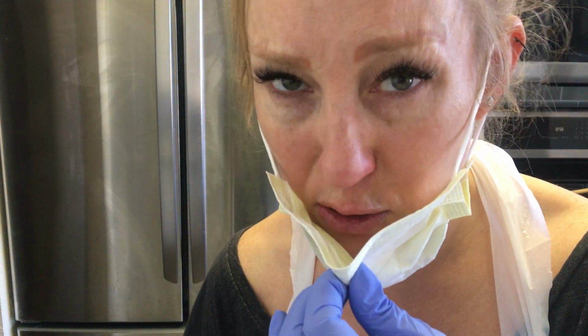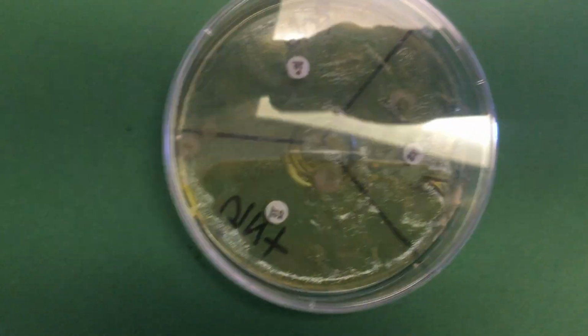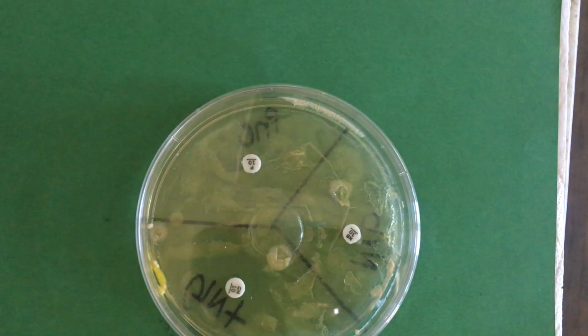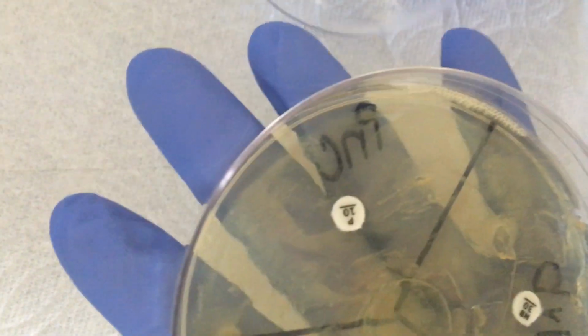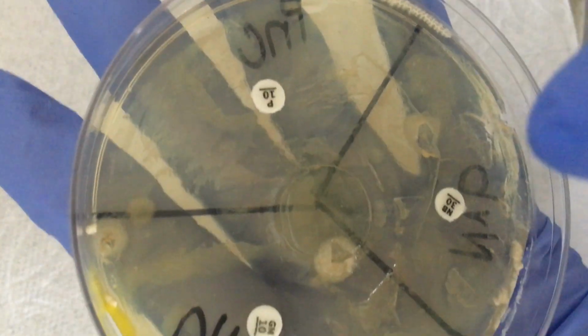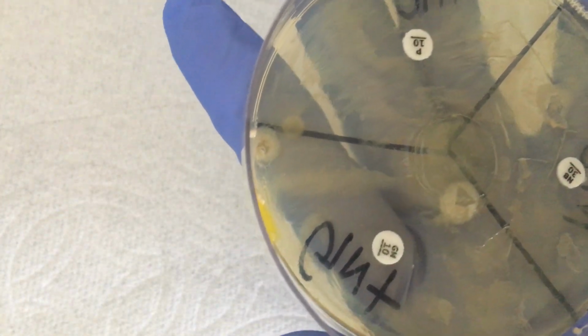Let me see if I can show you, because it's kind of difficult to see. I'm going to face this down here. I have a dark background and there's light reflecting. So maybe if we turn off the light, we can see. I'm not sure. This is a dark background, and I also used a white background, but basically what shows it is up close and personal. You can see the fuzziness, the haziness, around penicillin and also around the novobiocin, and then around gentamicin, see there's inhibition of growth.